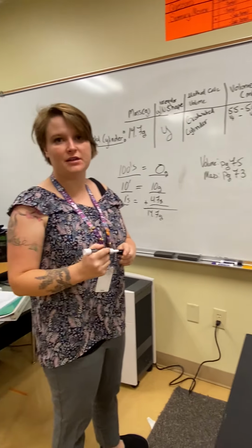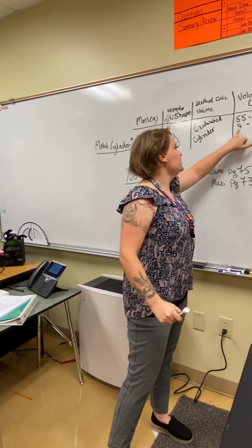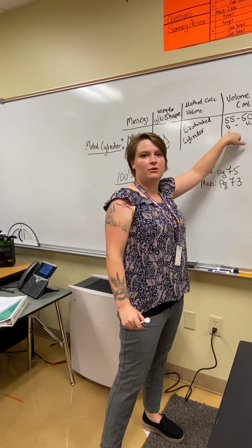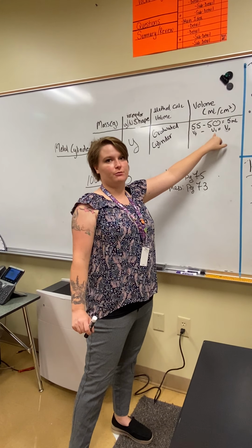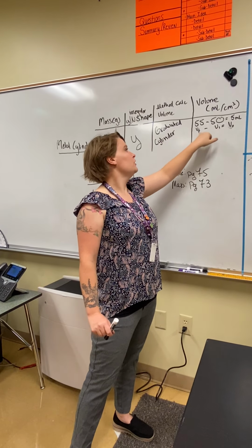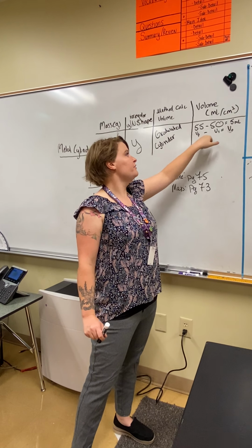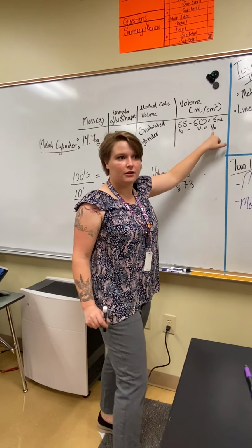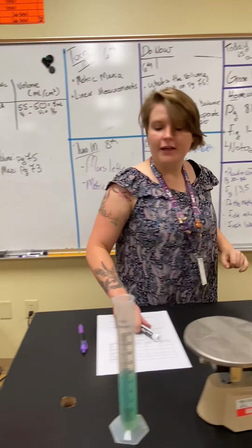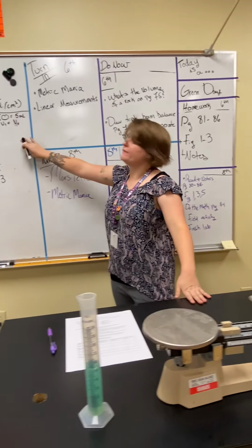All right, does that make sense? So I put V sub F for final volume of water, V sub I for initial volume of water, VI for initial, VF for final. You take VF minus VI, that equals the volume of the object. All right, so that is how you're gonna fill in this table.